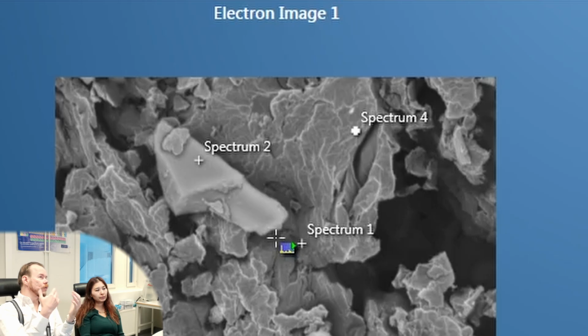So this is a very good thing to remember as a newbie on EDS technology: the region you're getting the X-ray information from is much, much larger than the spot size. It's in the micrometer range. The heavier the elements you're monitoring, for example steel alloys, the more that volume shrinks. But it will never be in nanometers. It's always in the micrometer range.